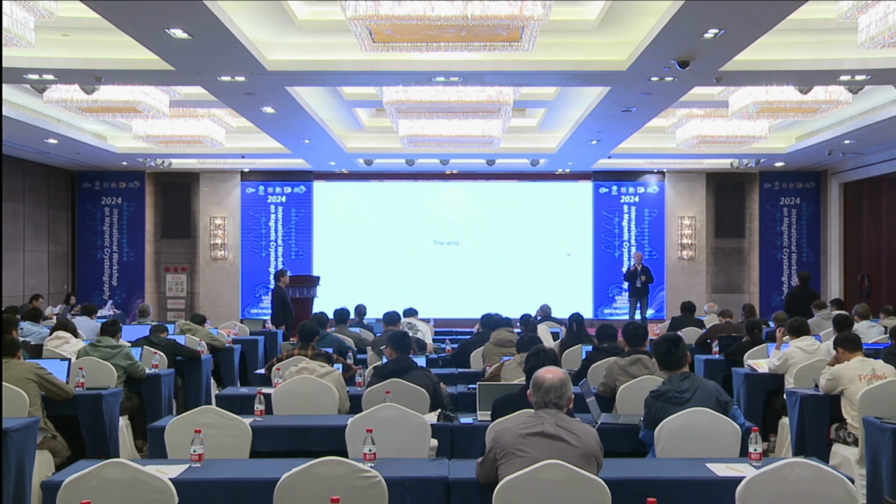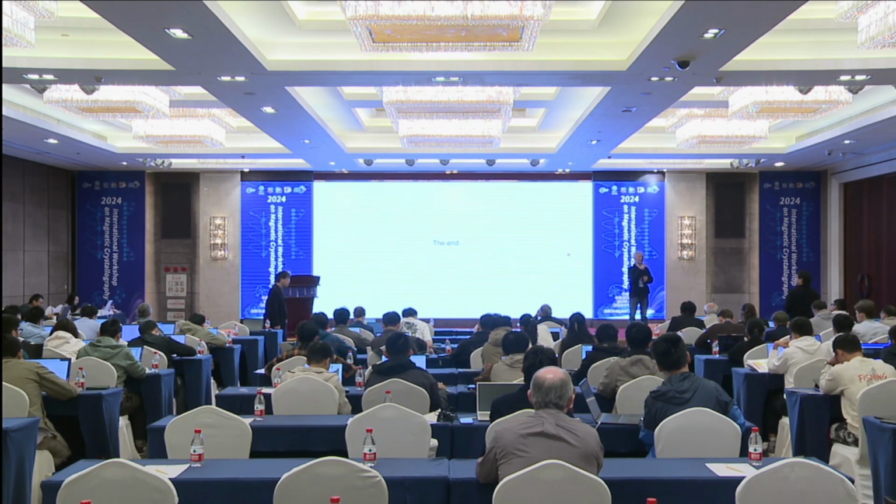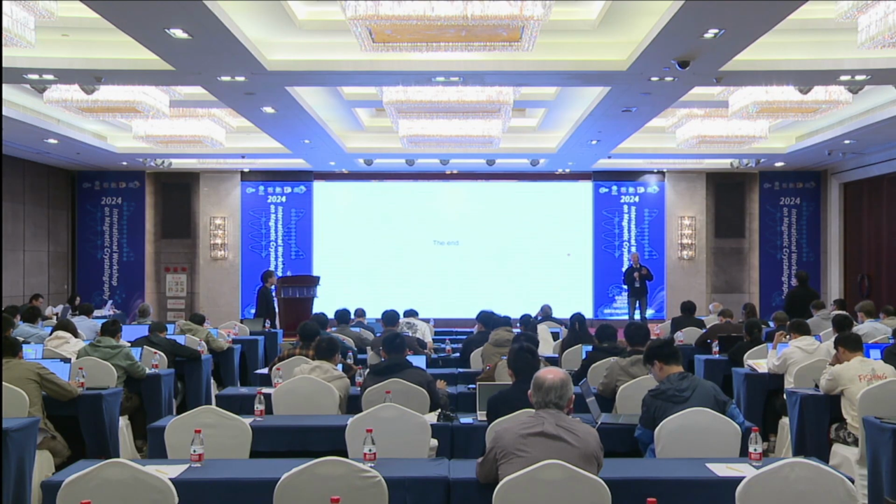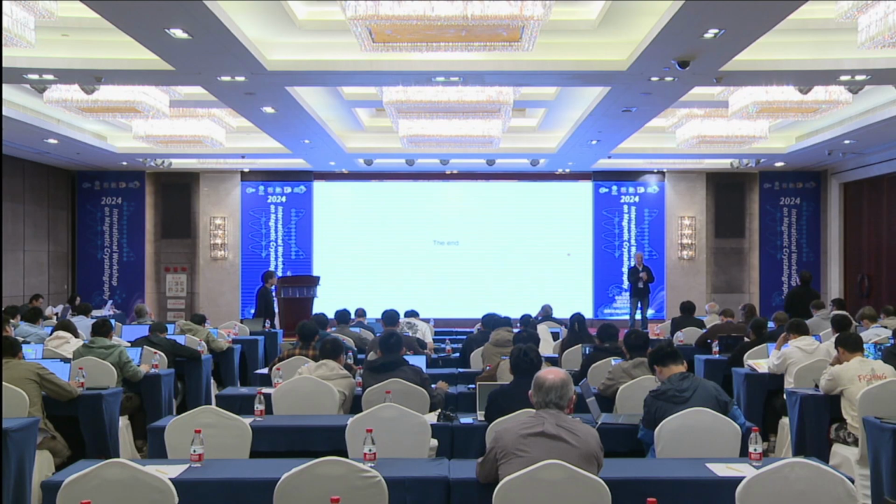So here is the representation: use the black and red to represent the open and the solid, so it's ferromagnetic or antiferromagnetic. But for the symmetry operation, it's not very easy. Some operations have a red or prime. It doesn't mean it's antiferromagnetic.